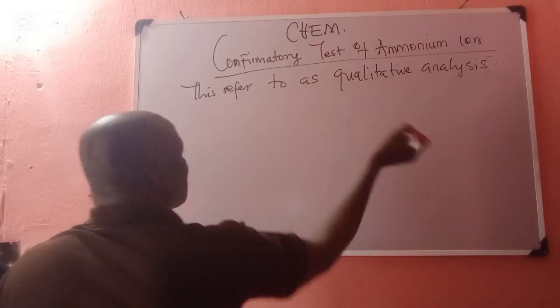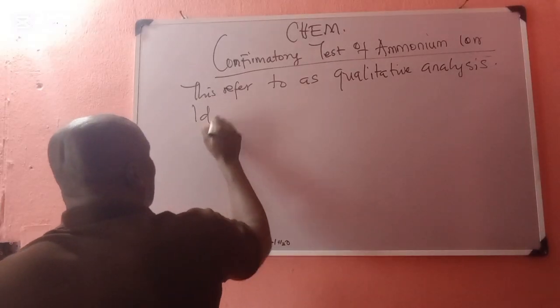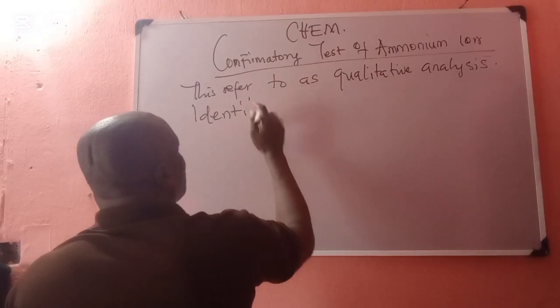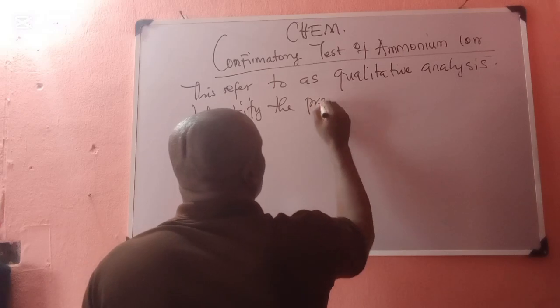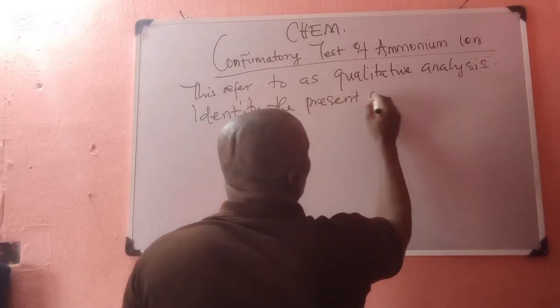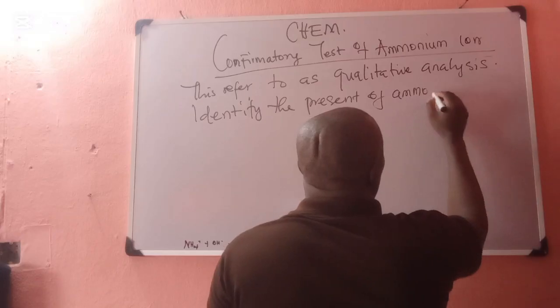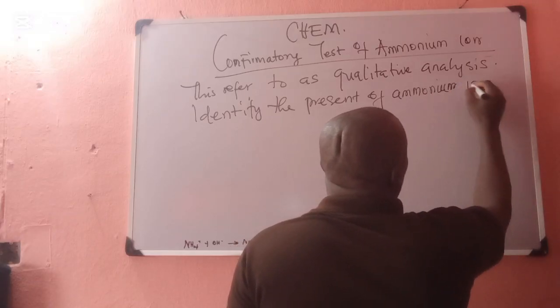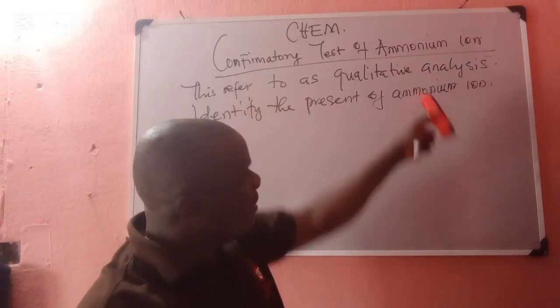So we are looking at the presence only, to identify the presence of ammonium ions.